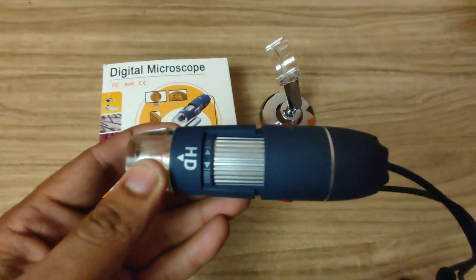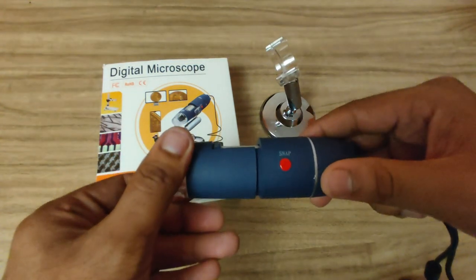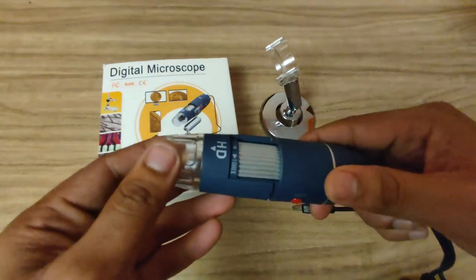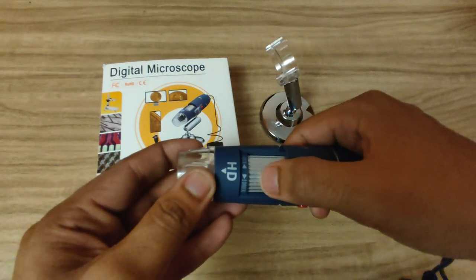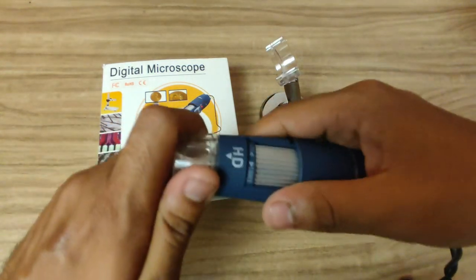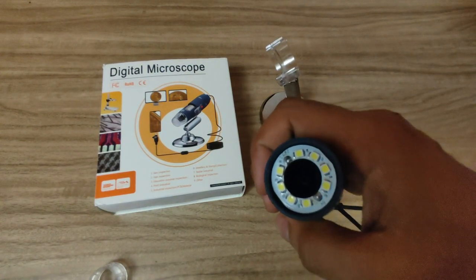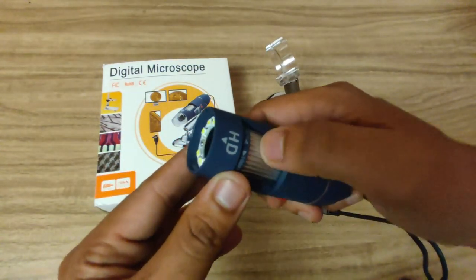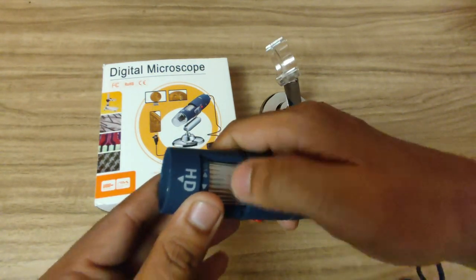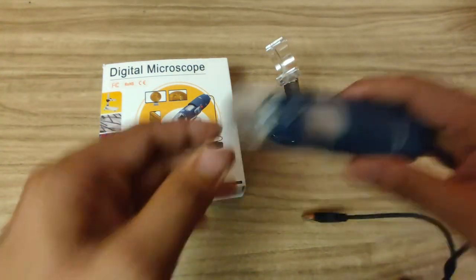Now if you look at the actual microscope, it's a full HD microscope. There is a button to take images, a button to turn the lights on and off, and a control to adjust the zoom. The zoom starts from 40x and goes up to 1000x. If you open this part you can see quite a lot of LEDs — the LEDs are very important here. If you rotate it to increase the zoom, you will see the camera comes out like this.